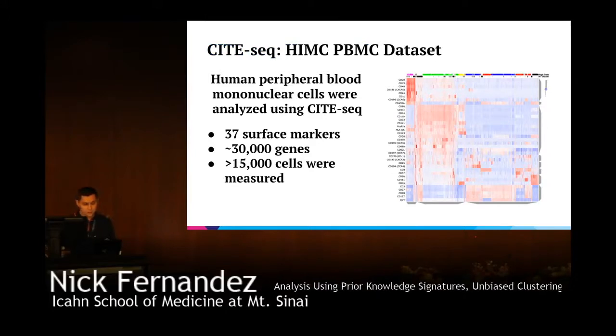So now we have this specific data set that is unpublished, from human PBMC. It's actually a lot of cells because it was multiple samples hashed together, but we have over 15,000 cells. I'm just going to look at both components of the data set. I'll start with the protein level markers here. Okay, I'll try and go real quick.